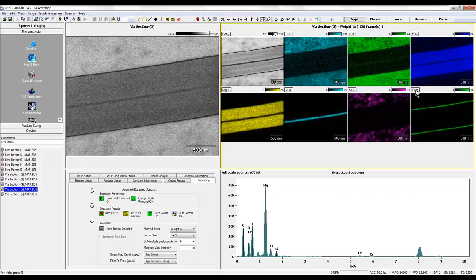And then last but not least, those very, very thin 20-ish nanometer thick layers are associated very strongly with chromium, shown here in green now. And again, it follows the surfaces very, very closely, and you're able to see that the stack basically goes completely mirror imaged: chromium, magnesium fluoride, aluminum, and then the same thing on the other side.